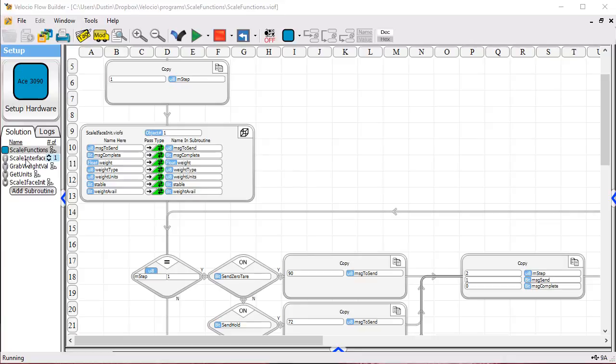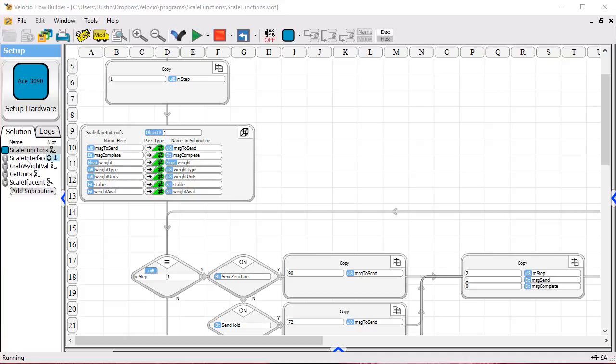You can see under the solution here that Scale Interface actually consists of four linked subroutines and it's going to demonstrate linking subroutines and also developing an initialization routine for the purpose of minimizing the amount of data that's got to be passed back and forth in subroutines and speeding up the application.